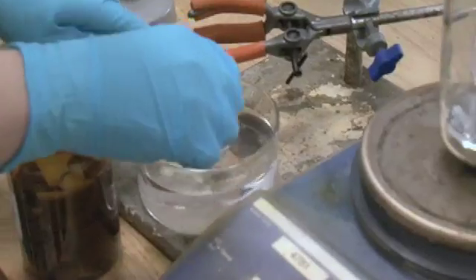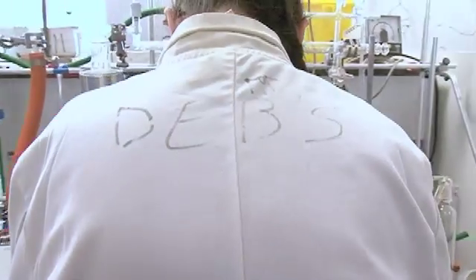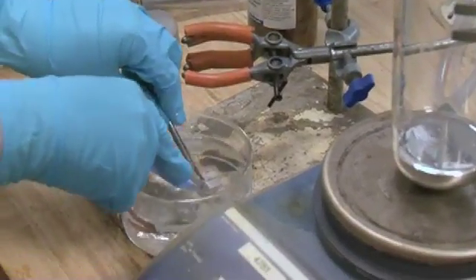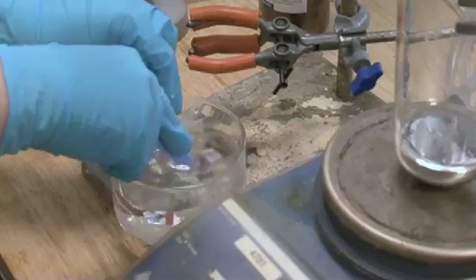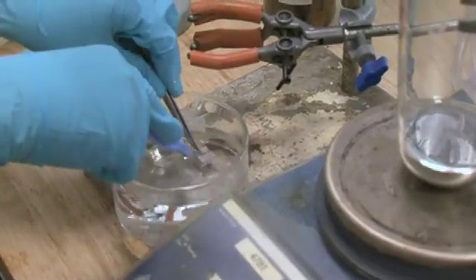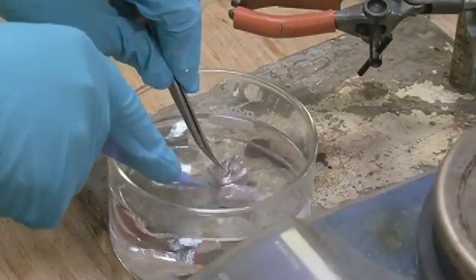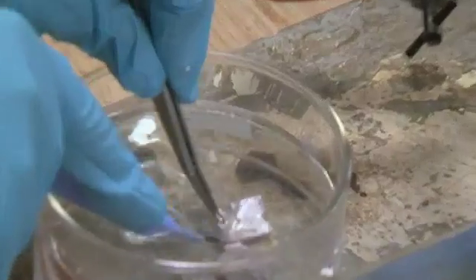Get it under the hexane as quickly as possible. So what we're going to do is like you would cut up your Sunday roast. Though it's a little bit stickier than roast beef. What we do is we just cut it into little chunks. As I expose it, it's all nice and shiny, but it'll probably tarnish a little bit in a minute.